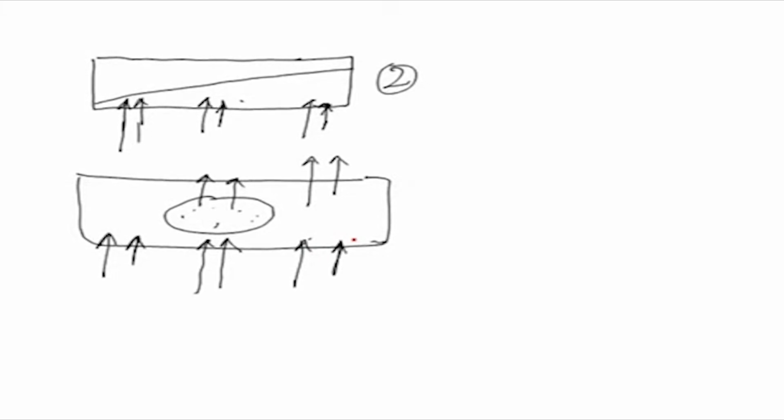So, you have two lights passing here which are perpendicularly polarized. When they pass through the specimen or other parts of the specimen, they will be differentially retarded.